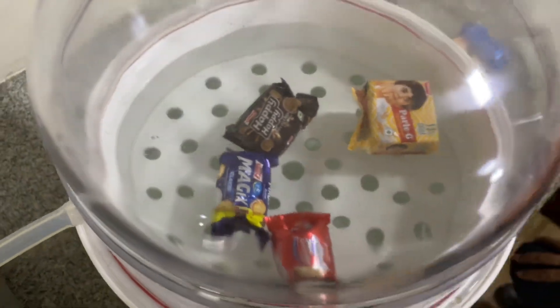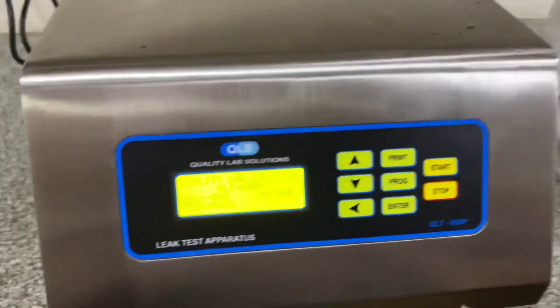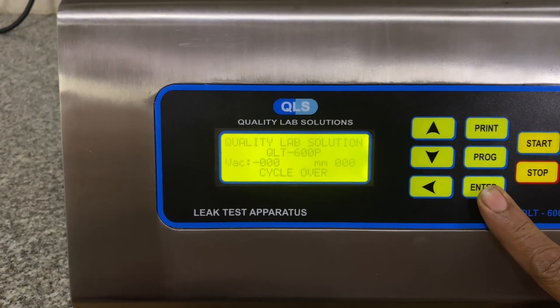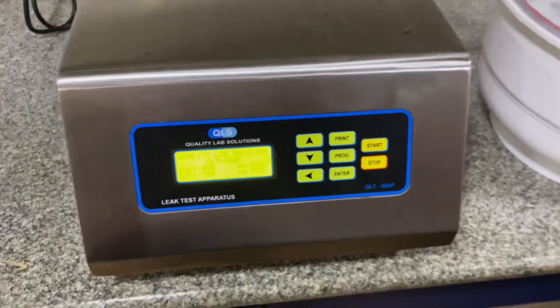This is how the test gets completed and we come to know which packet is leaking. This is the end part of the test, wherein you can print the result. The cycle is over — simply take the printout, record it, and complete the test.